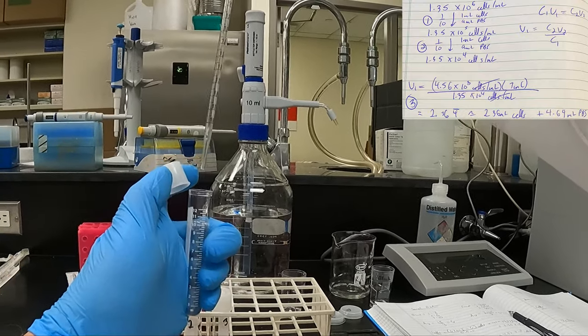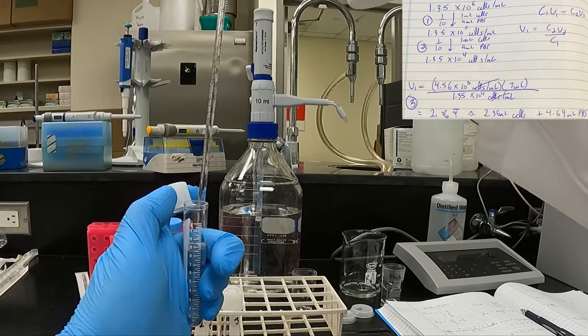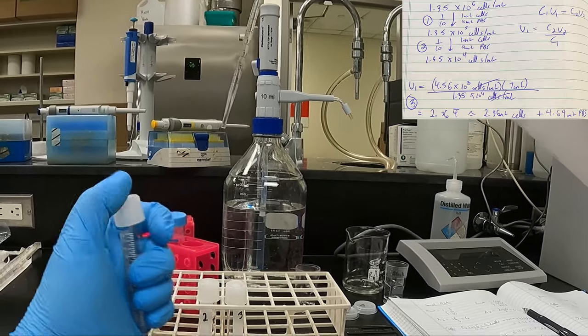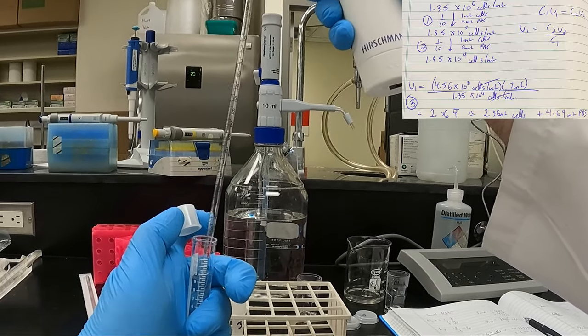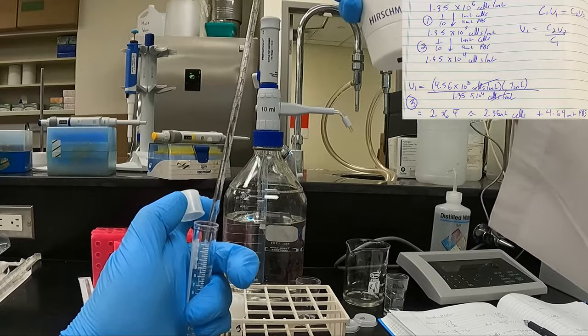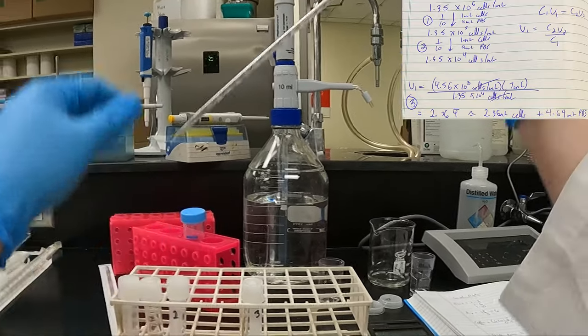I'm going to take 1 mil from this one as well. So this is tube number 2 we're going to be loading. 9 mils PBS, 1 mil of our cells. Tube number 2 is now done.